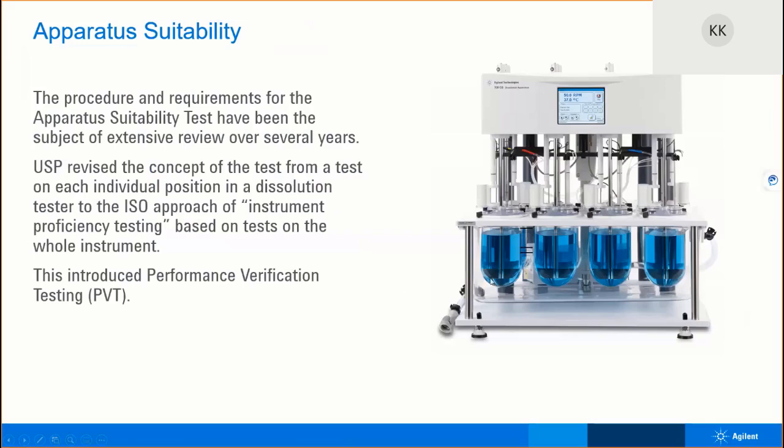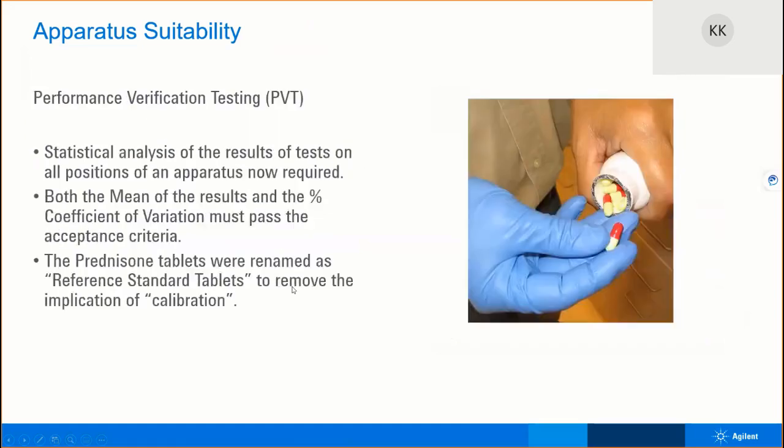So that your result or your apparatus suitability is based on the whole instrument rather than the individual position. And that was introduced as the performance verification testing.